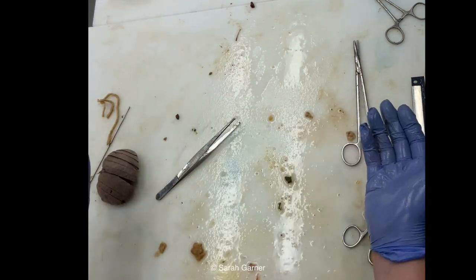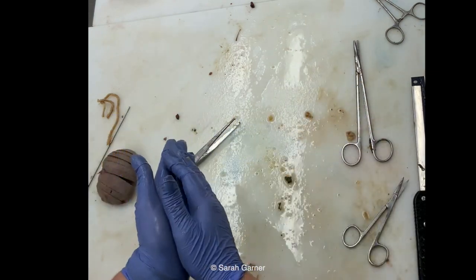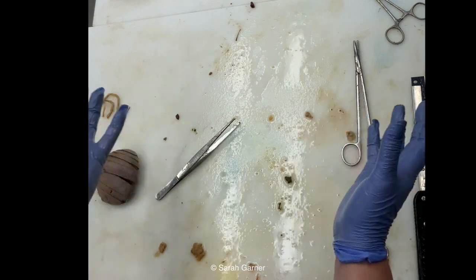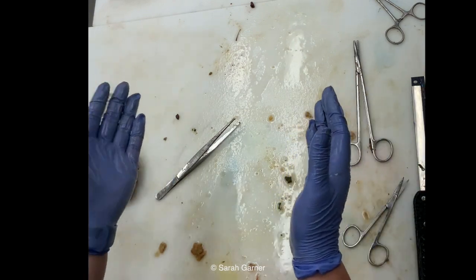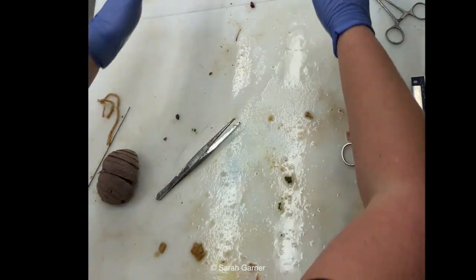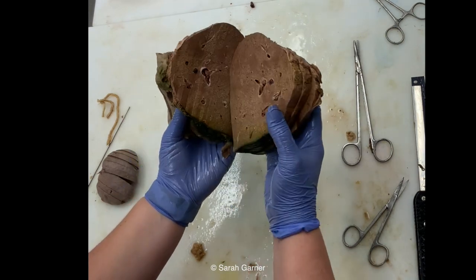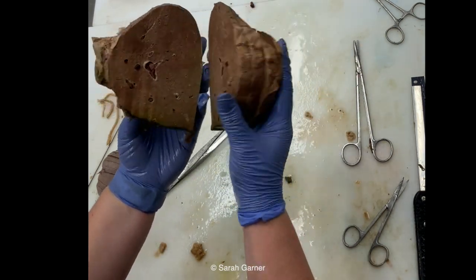Then, I think I did the liver next. Again, the order doesn't necessarily matter, but with the liver, you want to make sure you're opening up the whole inferior vena cava, examining all of that. And then you want to examine the outer surface of the liver, making sure you're serially sectioning the whole thing or bread loafing it. And that was what we saw here, right? And this one, like I said, looked a little bit congested.